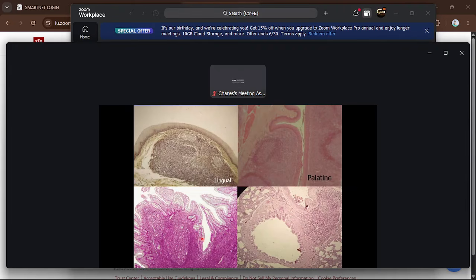This is also part of the lining of the intestines where we have lymphoid tissue, and their purpose is to capture the antigen and present it to B lymphocytes and also T lymphocytes.